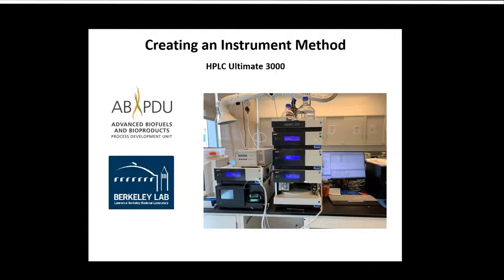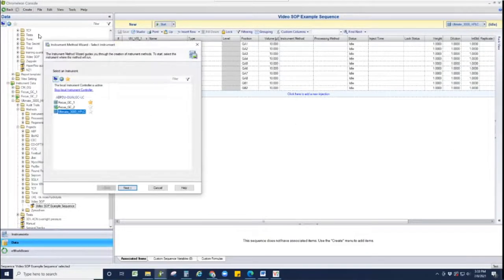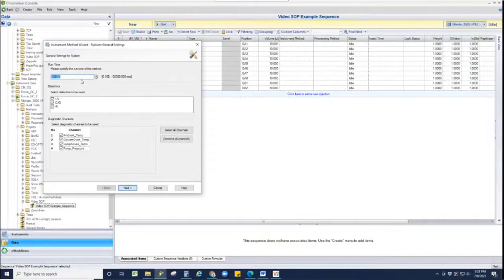If you do not have a known instrument method, you will have to create one. You can do this by navigating to the Create tab and selecting Instrument Method. First, you will be prompted to enter the runtime of the method. This will change depending on your samples. In the stage of method development, it is safest to start with a longer runtime and change it to be shorter after you are certain that all components of your sample are present in the chromatogram. You must also select which detectors are to be used.